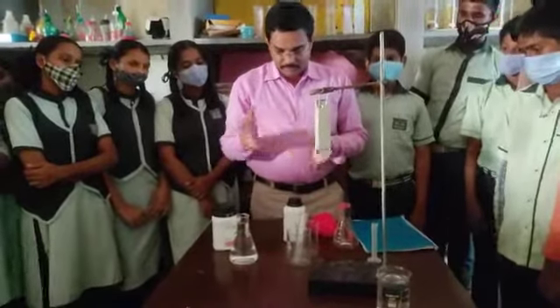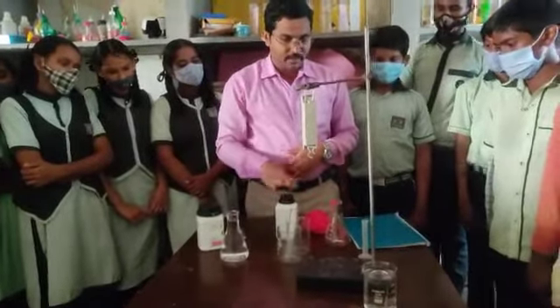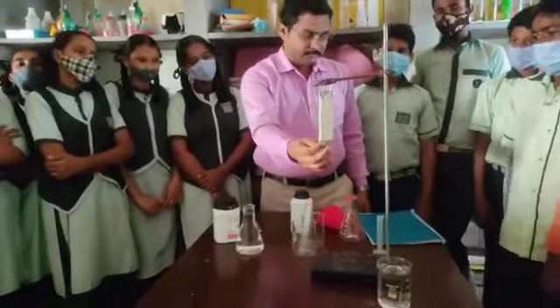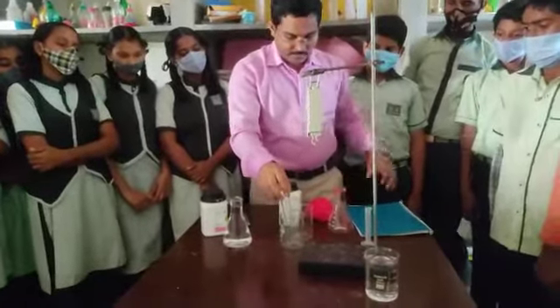We will now do that experiment. For this we require chemicals like sodium hydroxide and copper sulphate. Water is required for the balance, for weighing the mixture. This is the spring balance. And we need a conical flask, a beaker, a test tube, and a measuring cylinder.